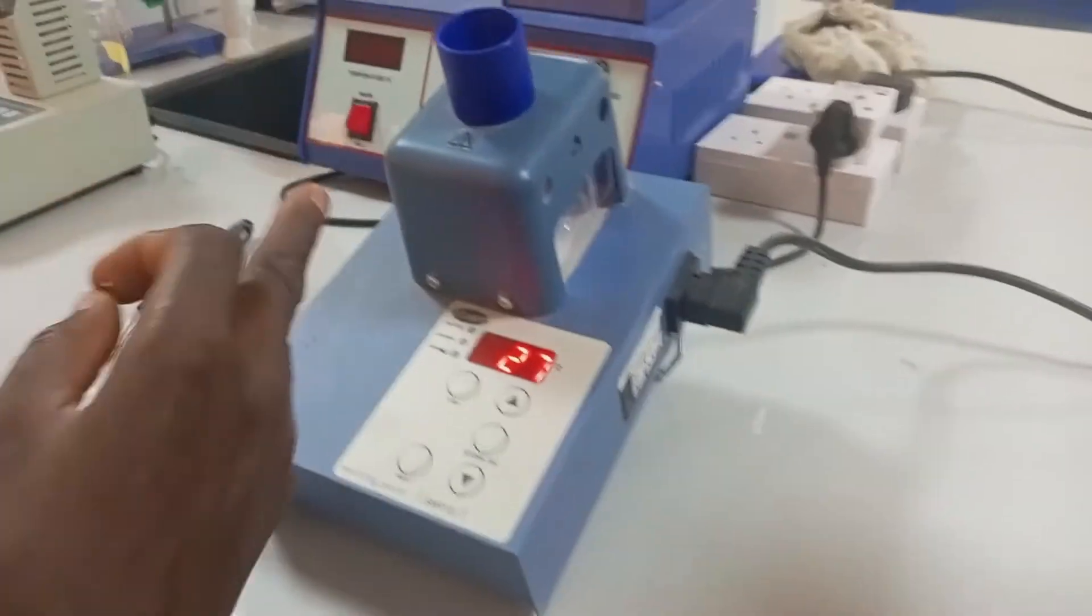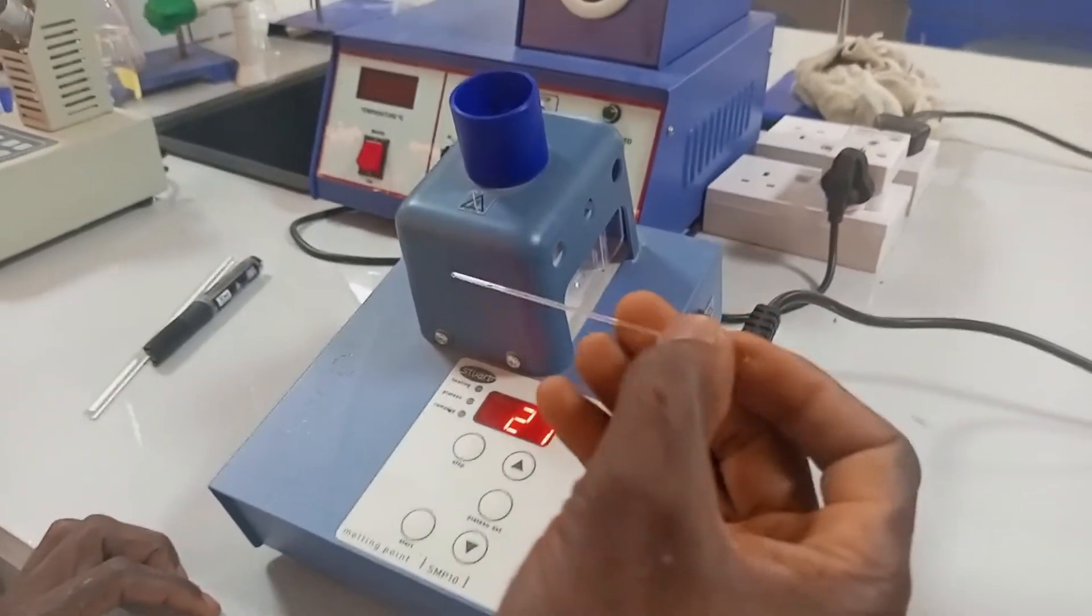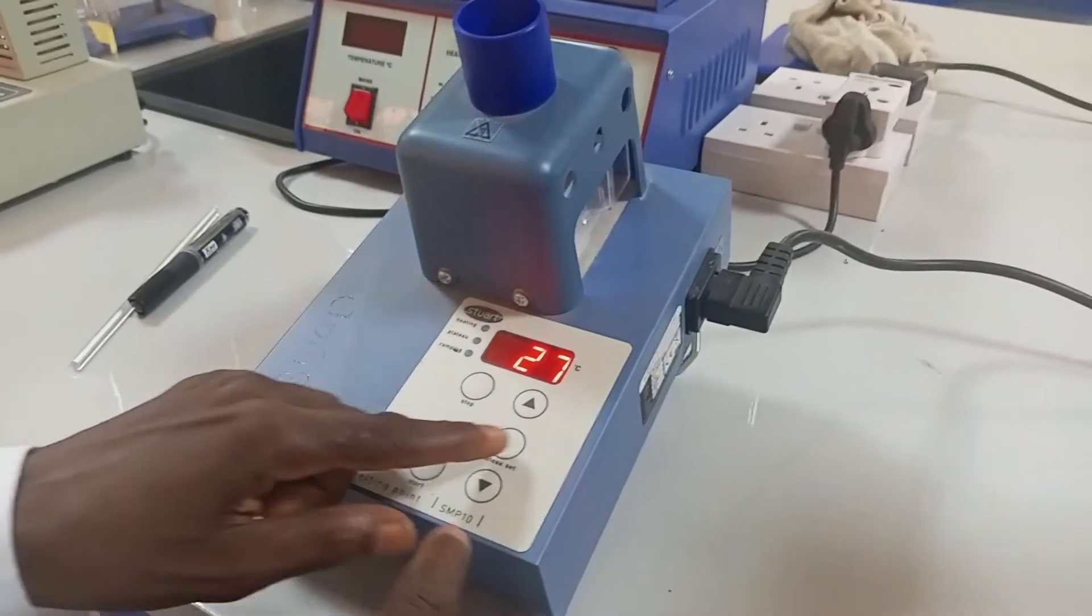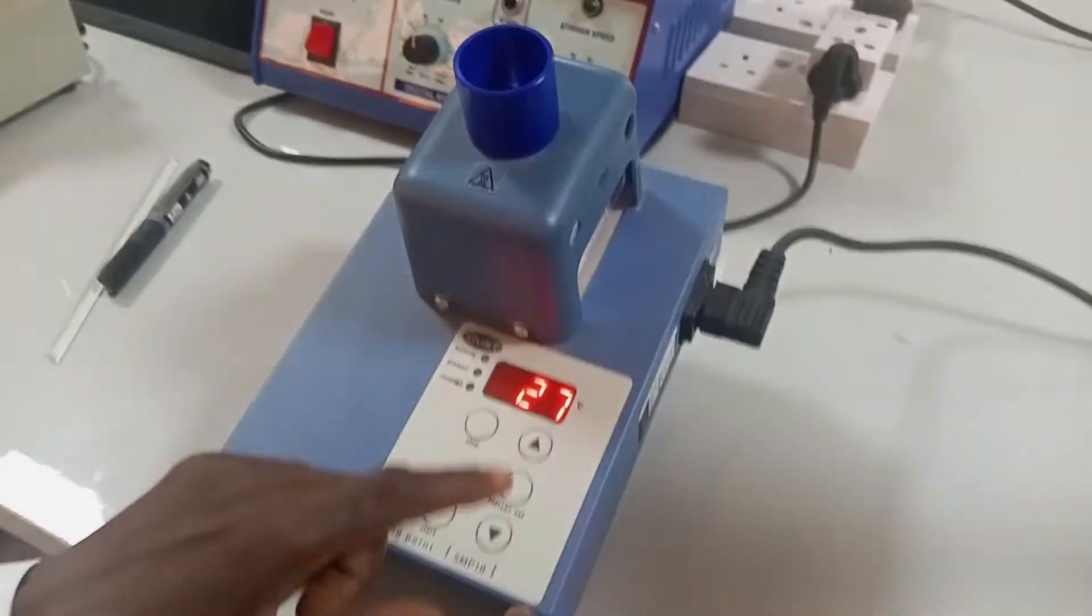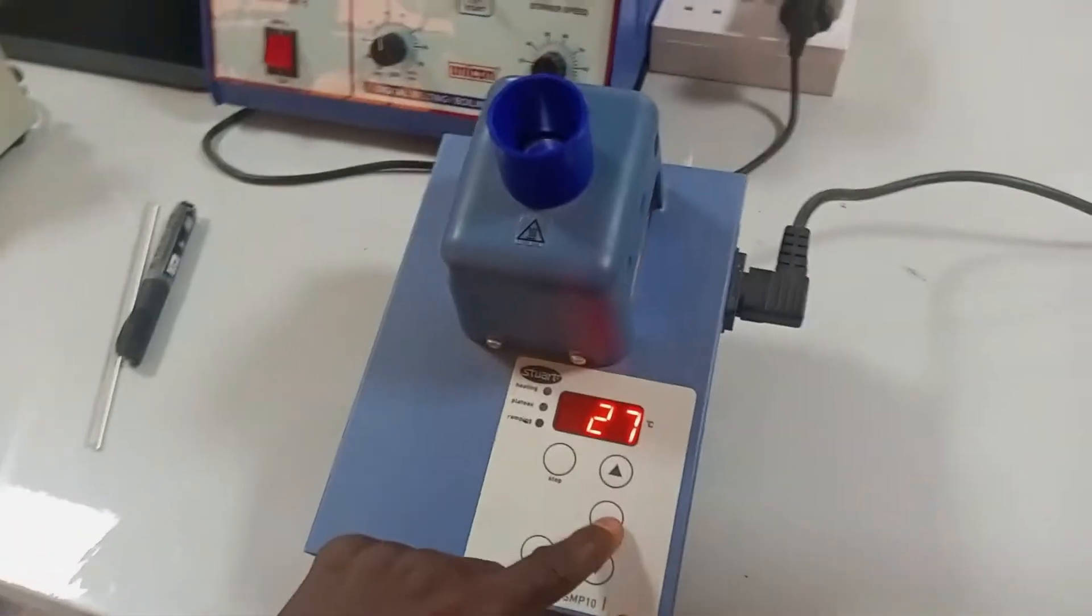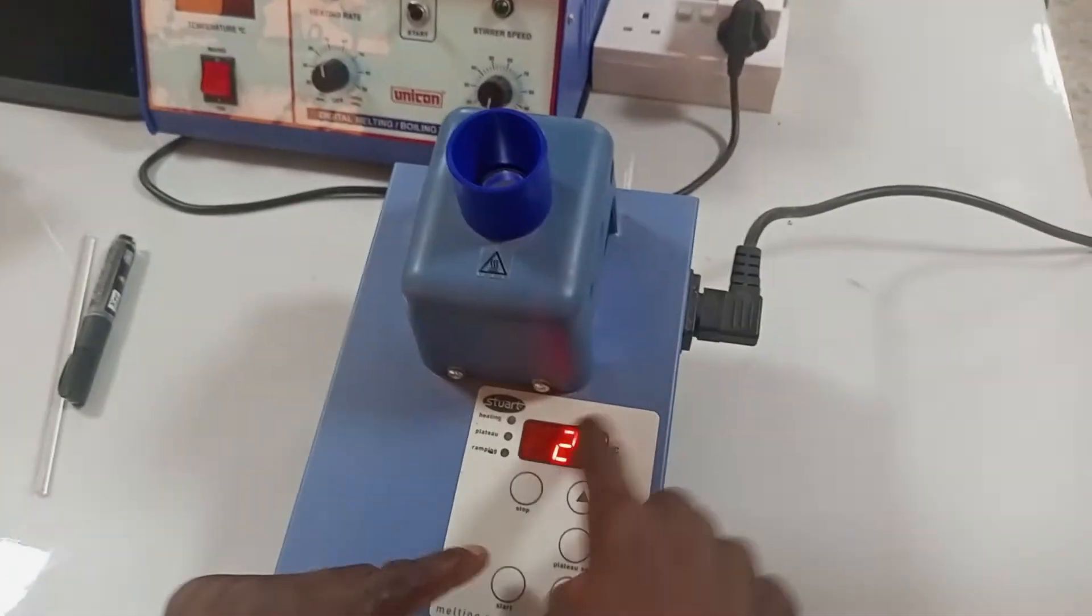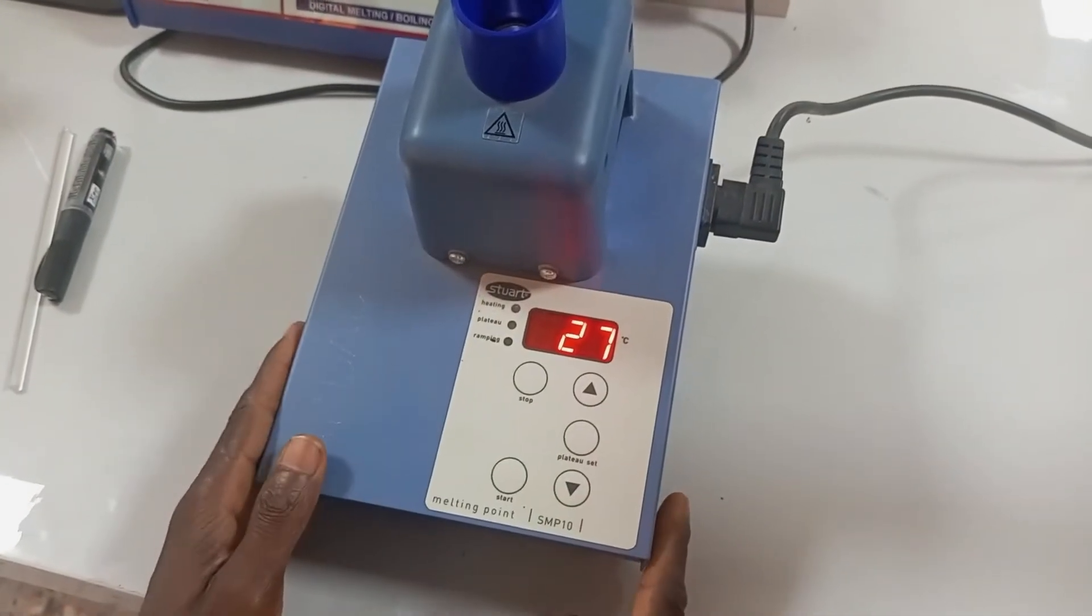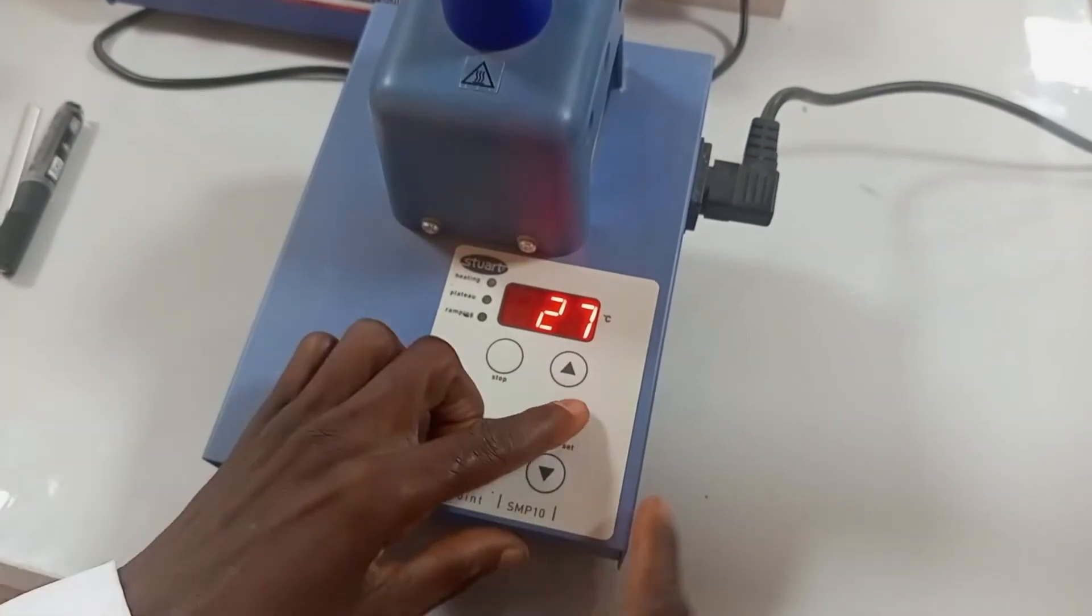The next thing is to determine the melting point of the loaded unknown organic compound. But before then, you have to set your melting point apparatus. This is showing that the temperature now is 27 degrees. The maximum temperature of this melting point apparatus is 300 degrees, of which we don't know the melting point of this compound.